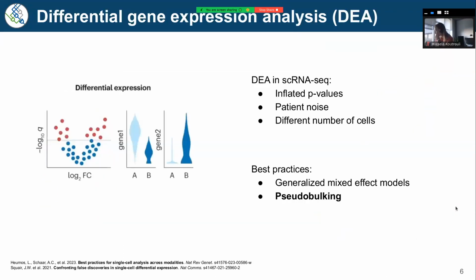But yeah, coming back to single cell. So obviously we can perform differential expression analysis at the single cell level, but it has some limitations. Because we assume that each single cell is a sample, we will get inflated p-values.